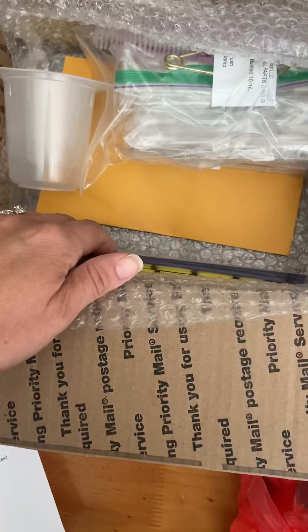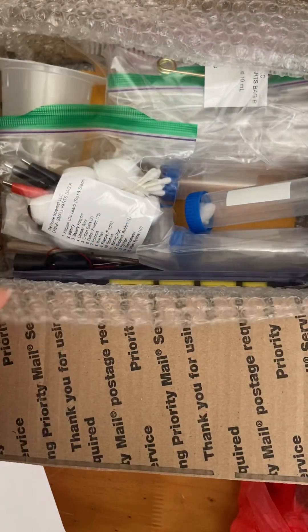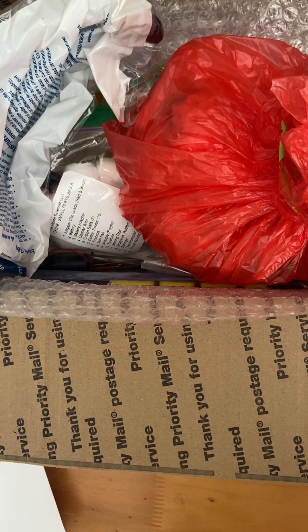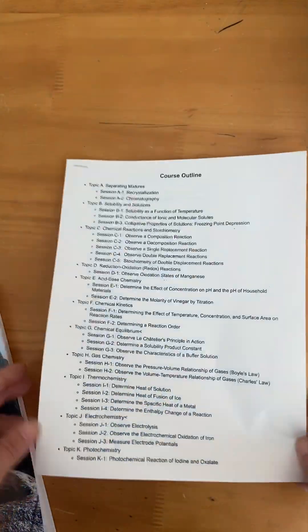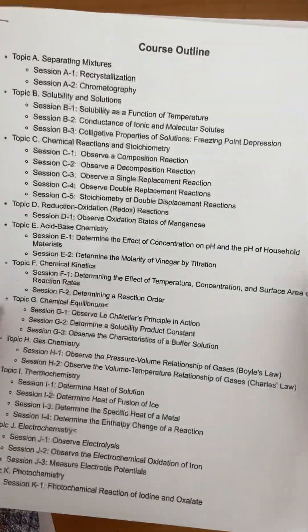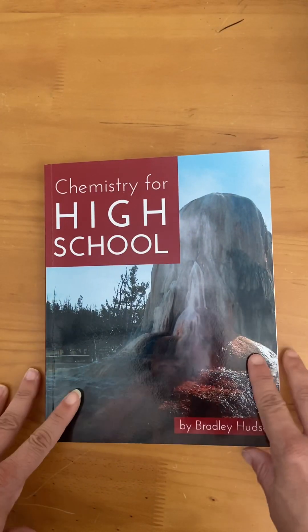One thing I was surprised didn't come in here is the actual labs themselves. You order this from the Home Scientist and it doesn't come with any instructions — only the materials. The actual labs you can find on their website, and I'll include the link. I went ahead and printed the course outline, which tells you the different topics and is also available on the Home Scientist website.